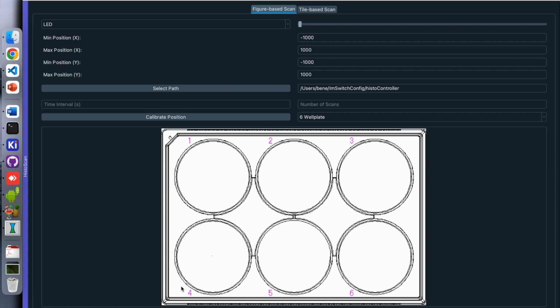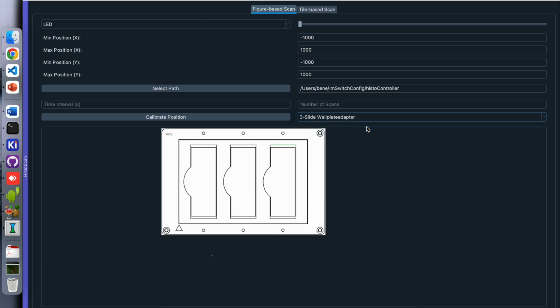And then I have a quick question. Sure. So for the well plate, can we design this ourselves? Sure. And let the microscope move. Exactly. So I already created 3 of those here, and I can also add the one for the robots. So I just need to derive that from the CAD I created back then. And then we have the 3 robots, and then it's the same thing.